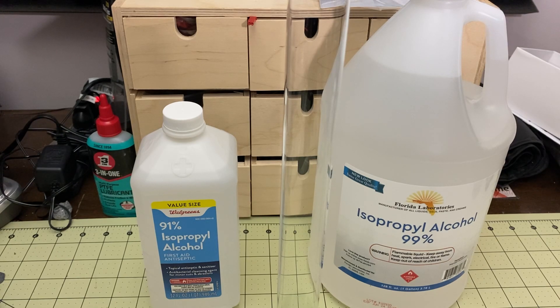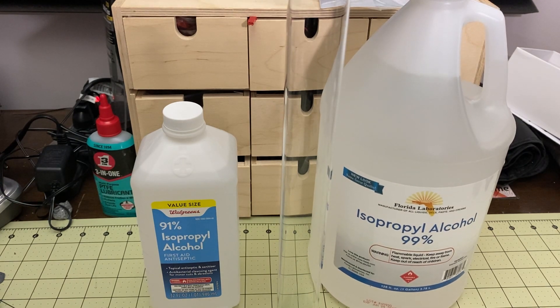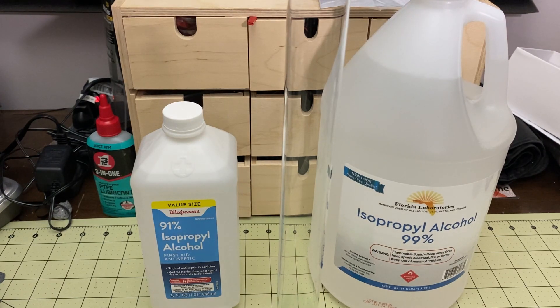Hello my fellow geeks, I'm Mark and today on Elite Geek we're going to do a really quick test trying the cheapest IPA I could find on Amazon. IPA has been really hard to find over the last year and prices seem to be finally coming down. I bought four gallons of this from Florida Laboratories on Amazon for $68, which is far cheaper — almost half the price of most IPA on Amazon.